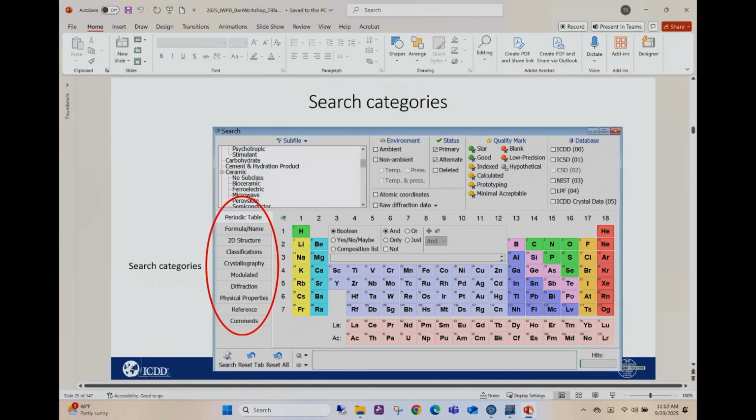But when you make the reference specified in yourself by a user defined PDF, is it also possible to search only on those PDFs in some other program, like HighScore? If I make a user defined PDF, is it possible to search only on those PDFs in some other program like HighScore?